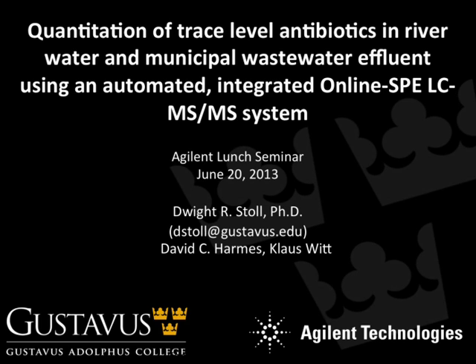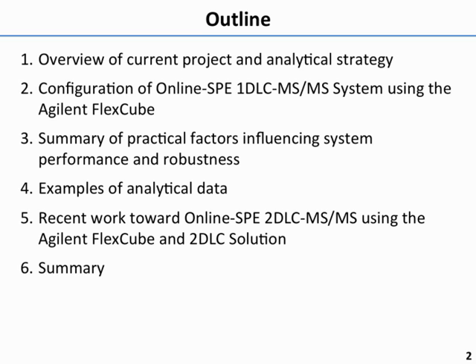As Annika said, I live in Minnesota in the U.S., and we have a state-funded project that's supporting determining antibiotic concentrations in some local rivers. So I'll just briefly give you an overview of the project and why we're particularly interested in this analytical setup, describe a little bit about how it works, and then talk just a little bit about some of the issues related to some of the questions that have come up here in terms of robustness and how many samples you can run and things like that.